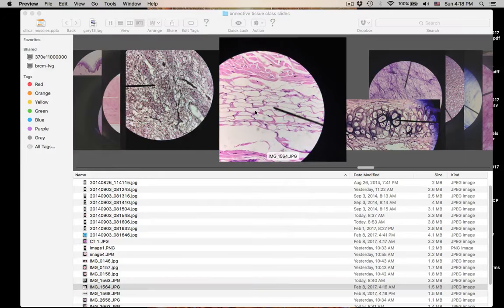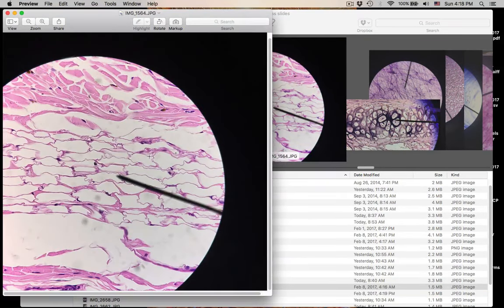Number eighteen: again, this is adipose tissue. Adipose connective tissue.